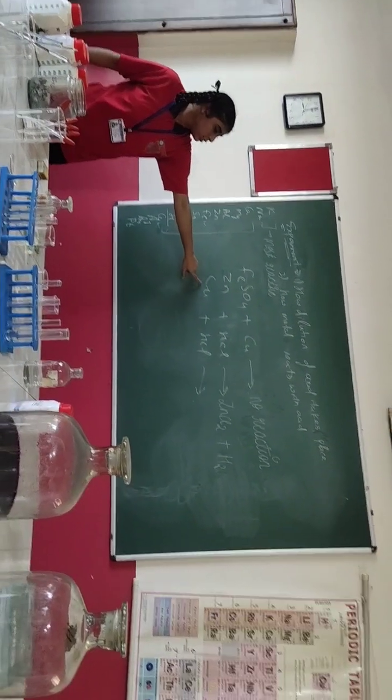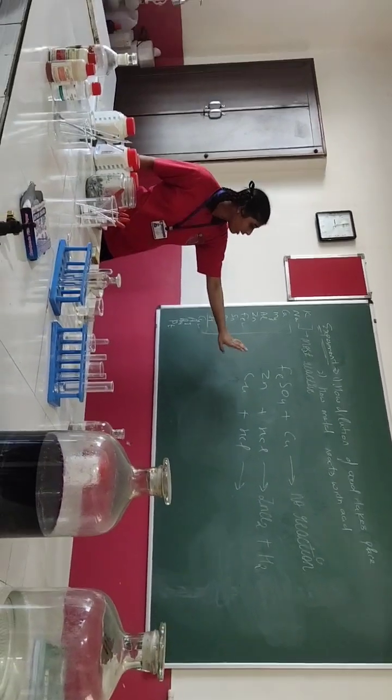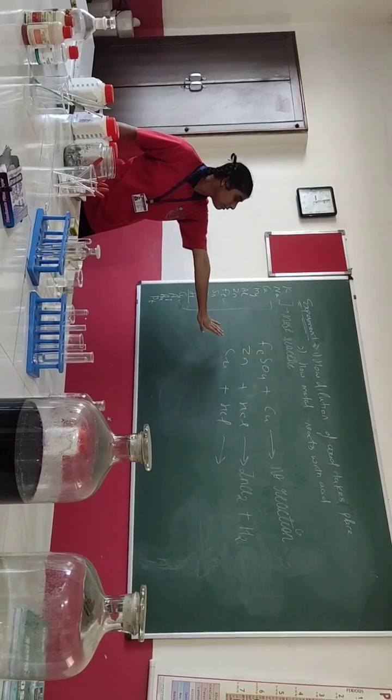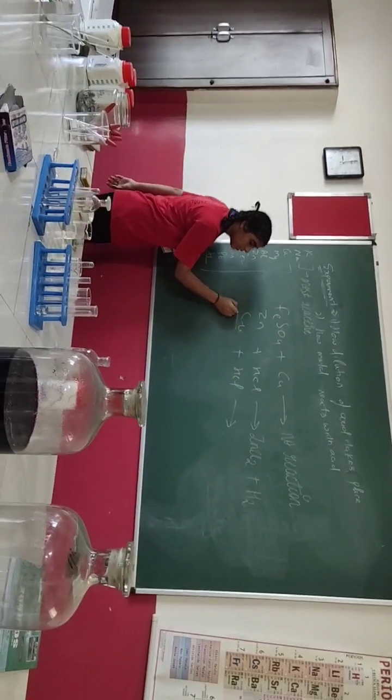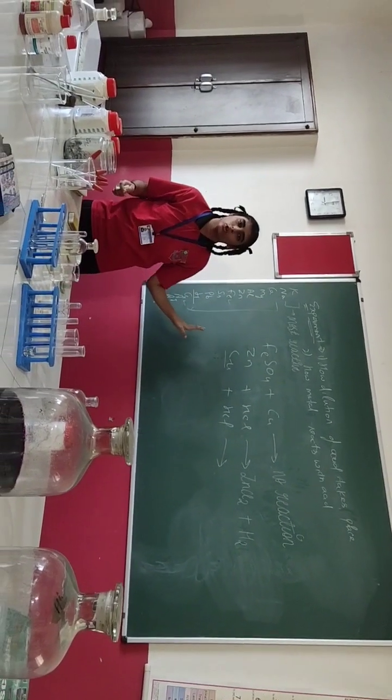The next element we have taken is copper along with HCl. Here no reaction, displacement will not take place because copper is less reactive than hydrogen, so displacement will not happen.